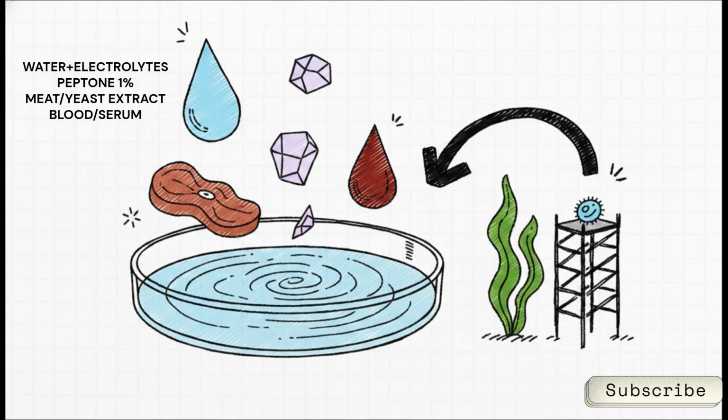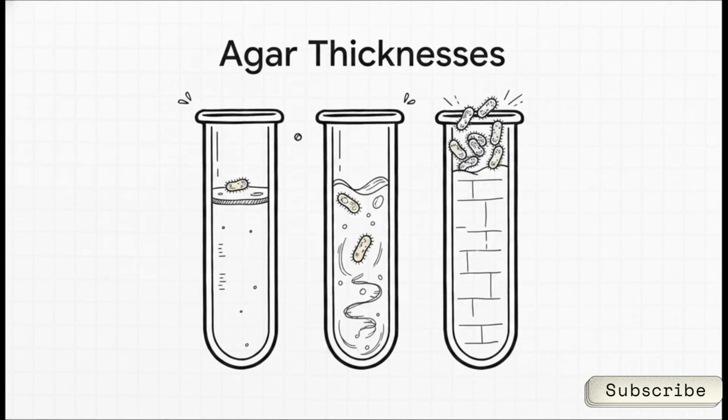But here is the absolutely crucial point for your exams: agar. Agar itself has zero nutritive value, literally none. Think of it purely as the concrete foundation of a house. It gives structure. It's a solidifying agent made from seaweed, acting like scaffolding for the bugs to sit on, but they definitely can't eat it.